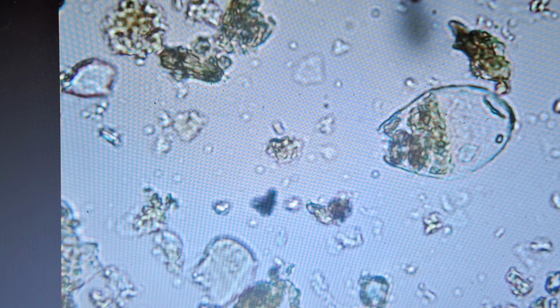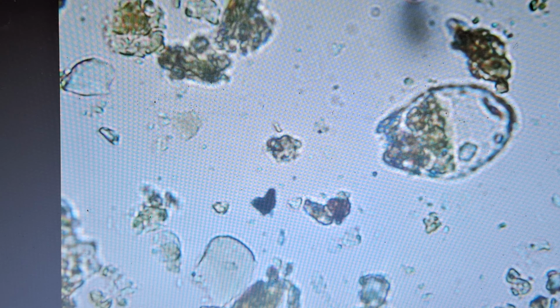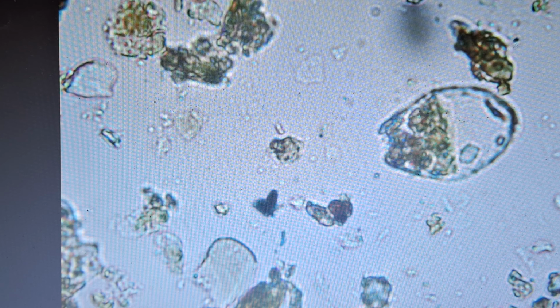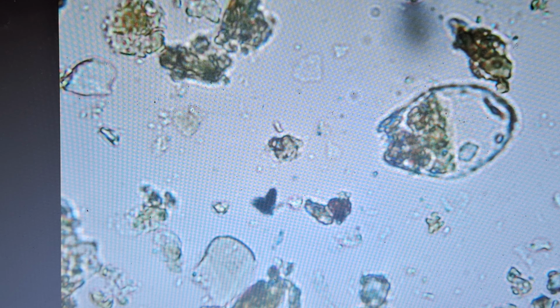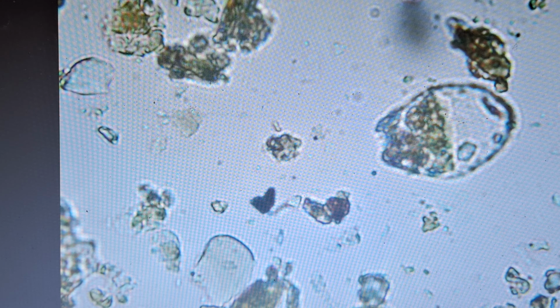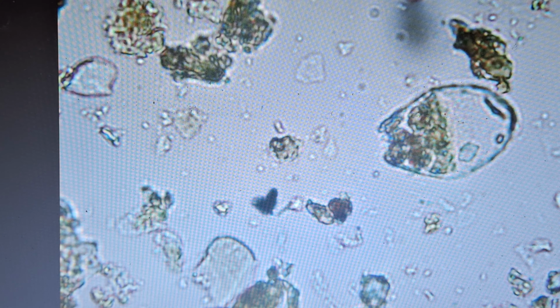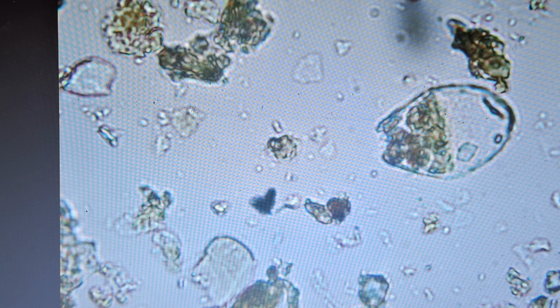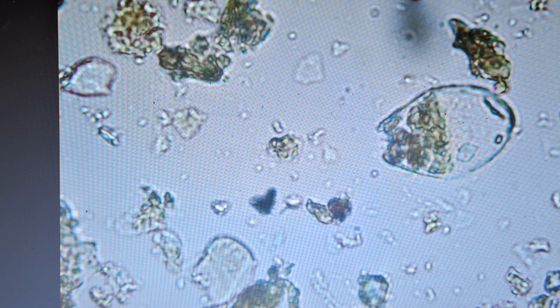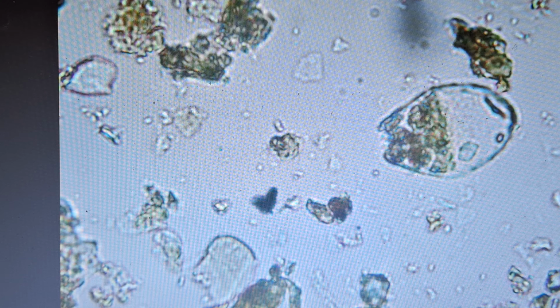The smaller things we see moving in different ways are going to be bacteria. We're seeing those bacteria all separate, moving around, dancing around, jiggling around. There's some rod-shaped ones. We don't want to see ones that look like a long Z, or a long snake. We don't see any of those. The way we tell the difference between good and bad is there are signs of how much oxygen is in the environment. So this is a sign of a well-oxygenated environment. We're seeing these testate amoebas and all these bacteria that we want to see.